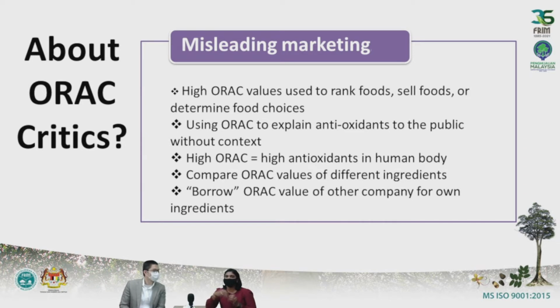For example, like juice of an orange with the extract of a mango. And some even borrow the ORAC value of another company for their own ingredient without testing their own ingredient, which itself is a bit unethical as well. Yeah. So there are many debates on ORAC, which leads to the reason why the USDA has brought down or withdrawn the ORAC database from their website in year 2012.